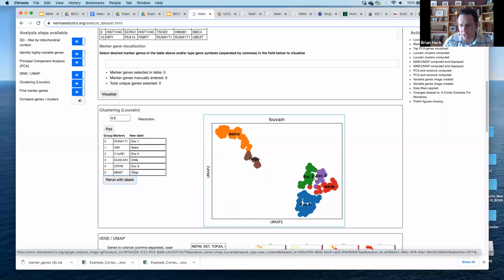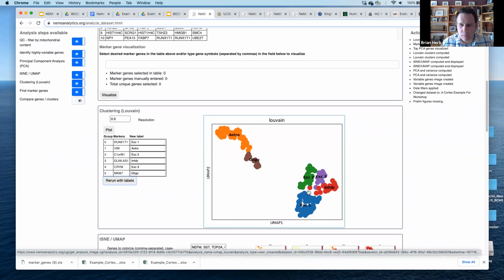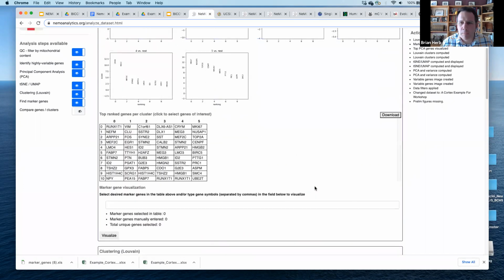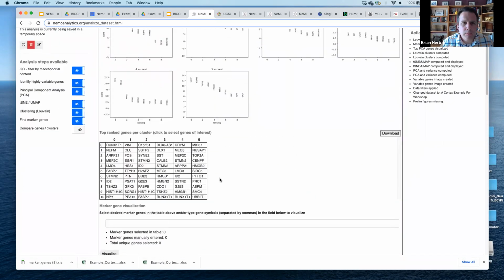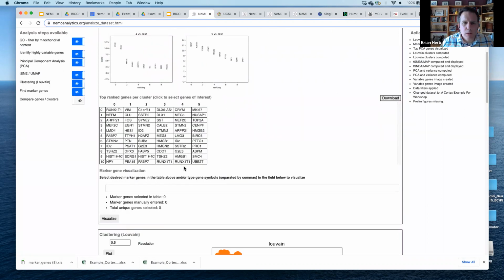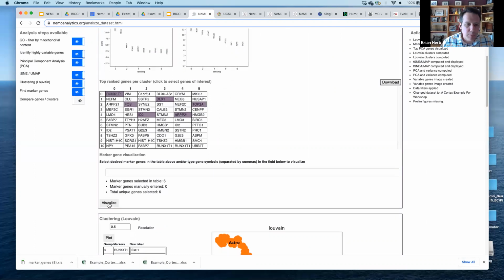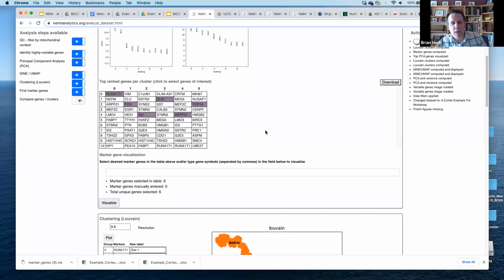All right, so that's just my guesses right now. And again, this is based on what I've also worked with this data set. And so let's just take this for gospel for right now. You can use that then if you wanted to visualize each individual gene as well. Say there's a couple of genes on here that you found particularly exciting from your previous research. You can also visualize independently. This will produce a dot plot.